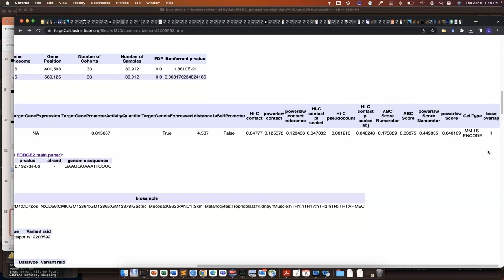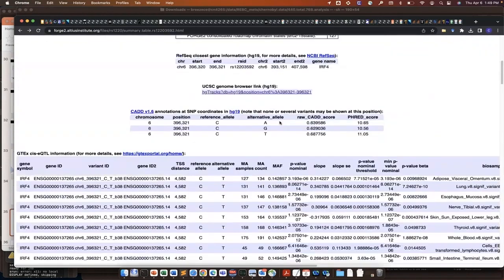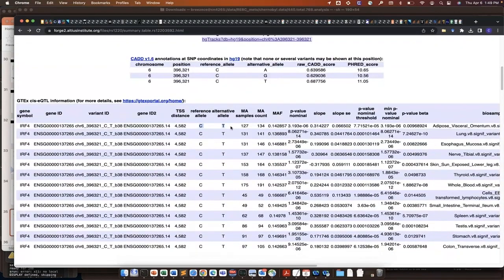ABC did their experiments across many cell types because they wanted a lot of material. You need a lot of material for Hi-C. So it's not always the cell type that you would wish. But we can have a look at this particular cell type, peripheral blood of multiple myeloma. So it's just a bloodline. So in blood, which I think is critical here because I've always seen lung cancer enrichments in the immune cells. Can you also scroll on the right?